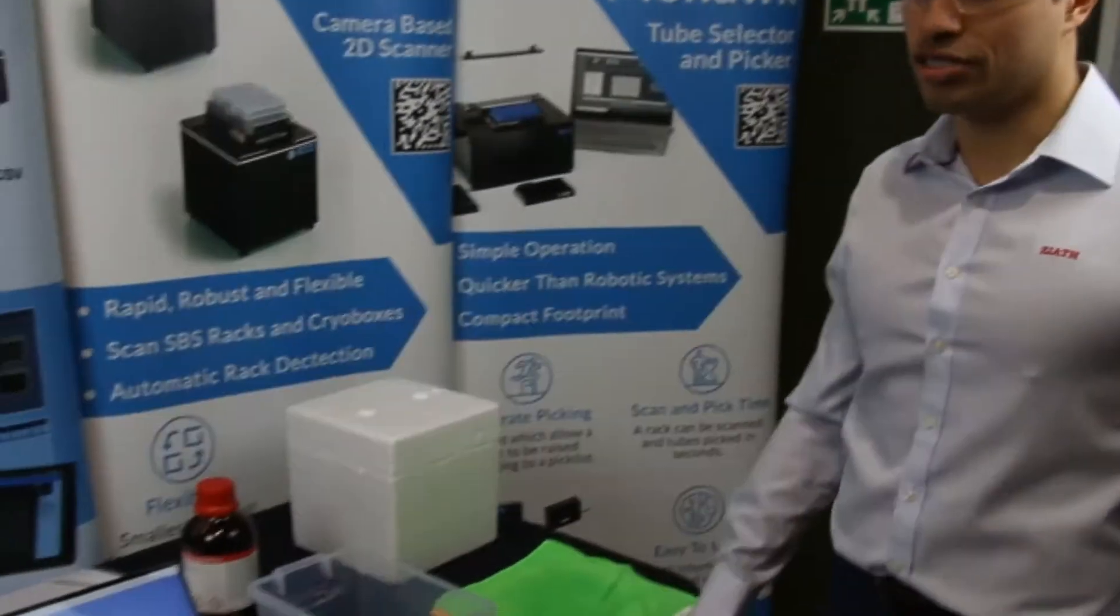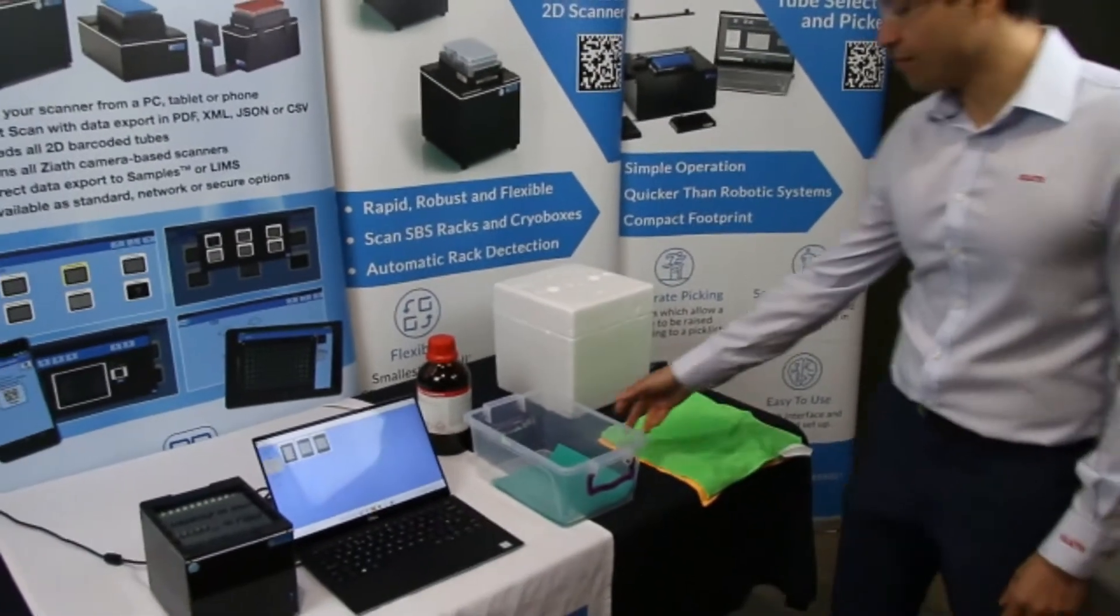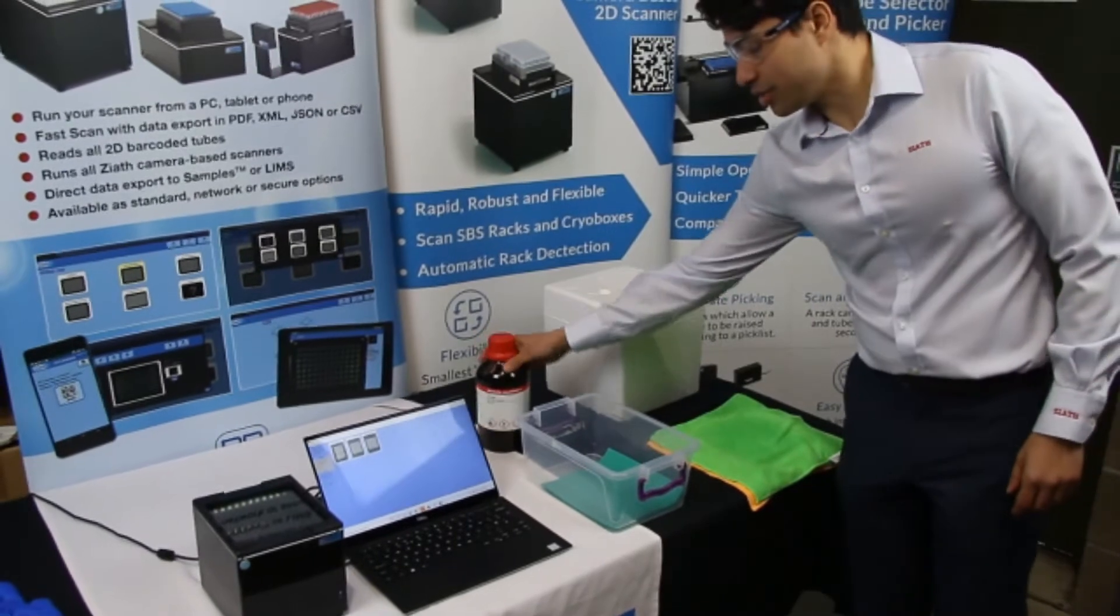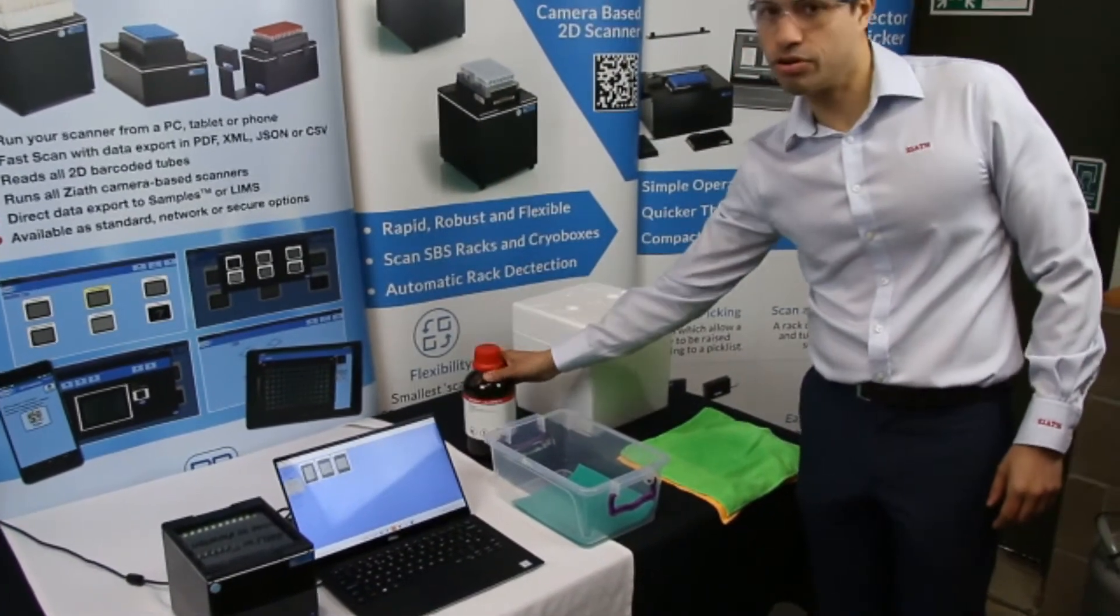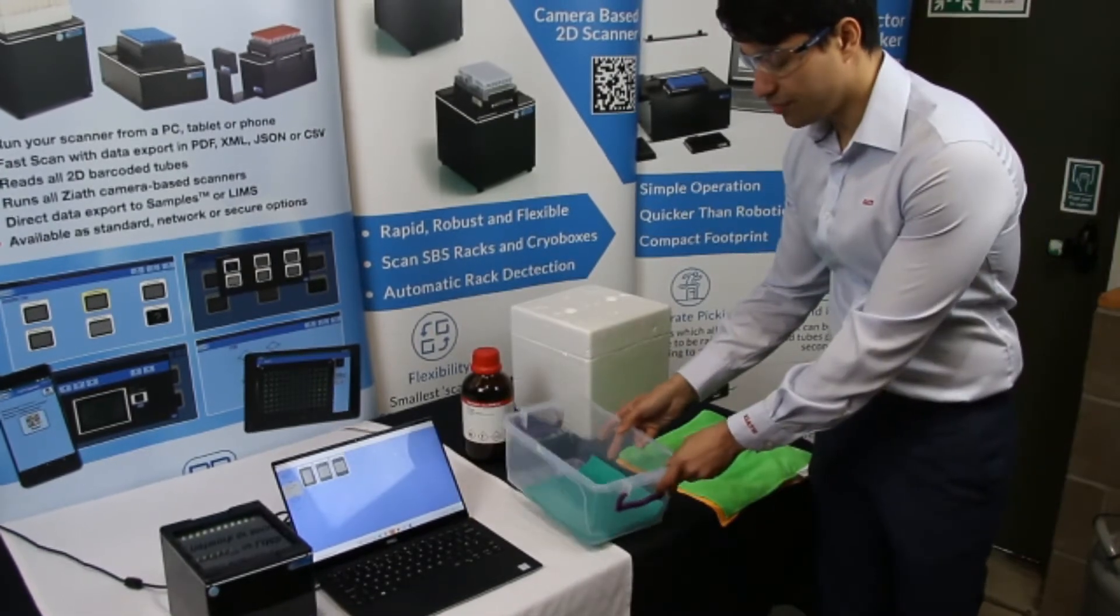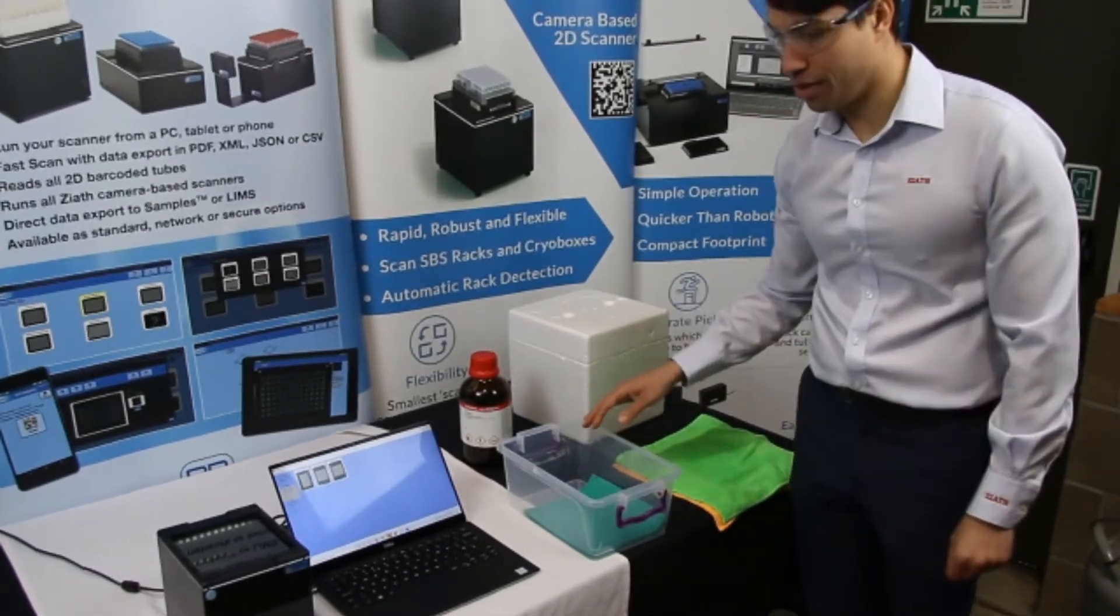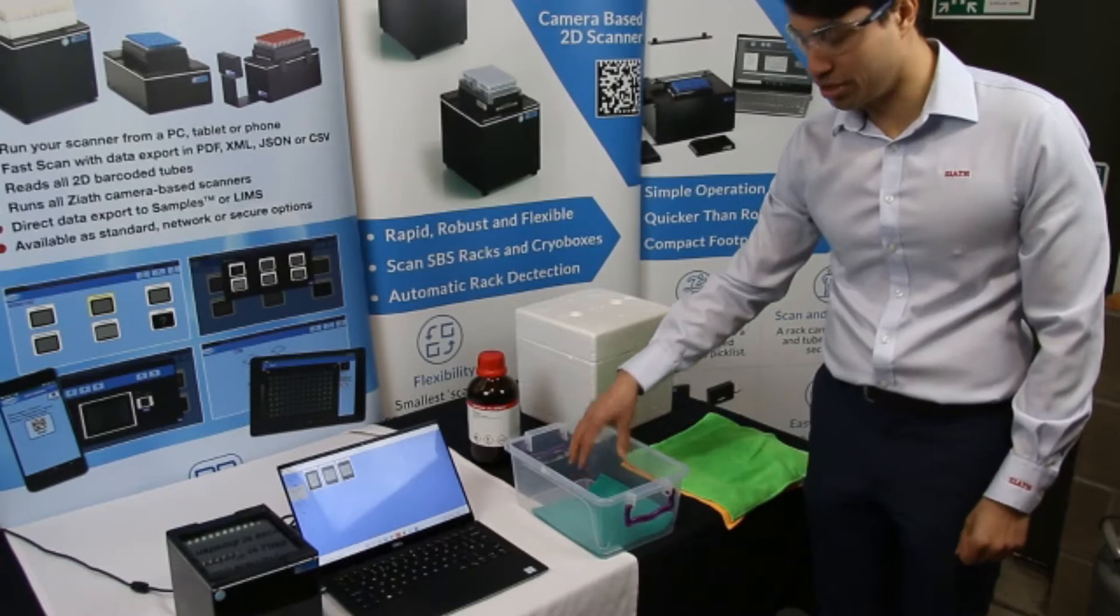On the table we have our liquid nitrogen station prepared where we have an ethanol bath which contains 100% ethanol. Do try and use 100% ethanol where possible. The bath is filled up with a layer of ethanol and the sponge is submerged in the ethanol.